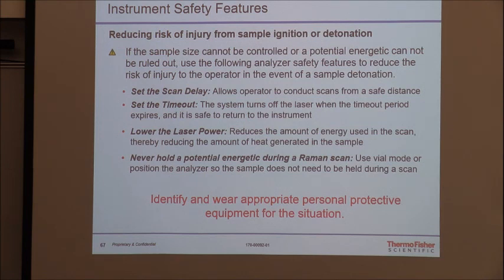Okay? Now, I wouldn't have anybody and everybody do it. I would have to kind of control it. And it's something that if you didn't want to do immediately, you wanted to do it 6 months from now, you say, hey, Chevron just introduced this new chemical and I just checked my library and it's not on there. You can call the number and we will walk you through how to get it on. Okay? It's very simple, but you want to kind of control it because you're building the spectrum at that point. So you don't want to go to the medicine cabinet and start throwing things together. If you do that, there are some caveats.